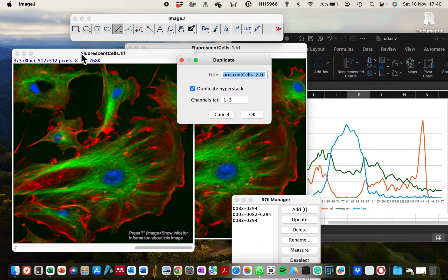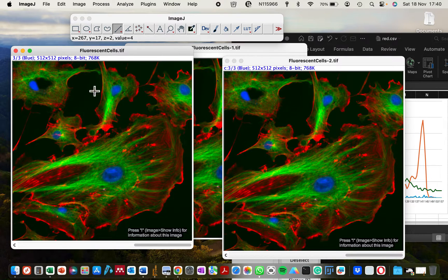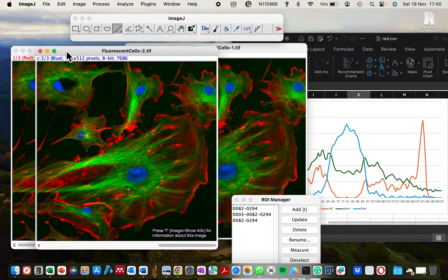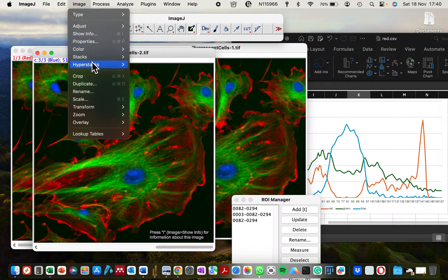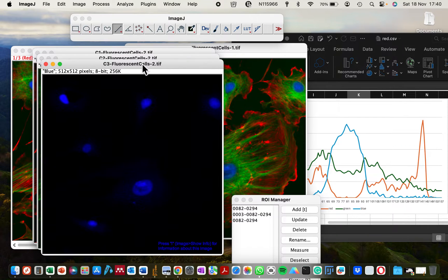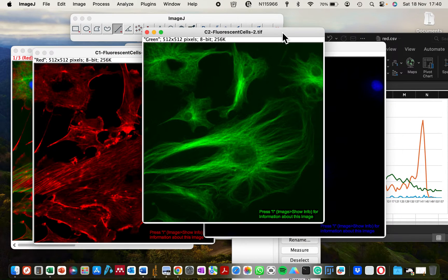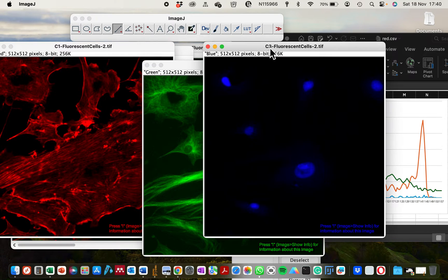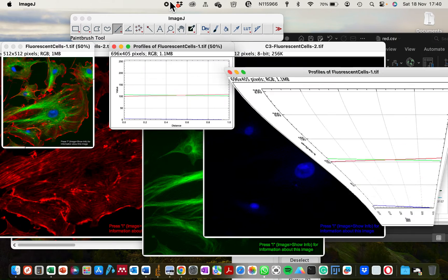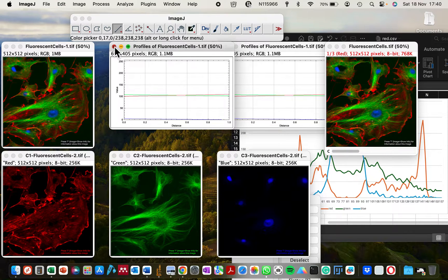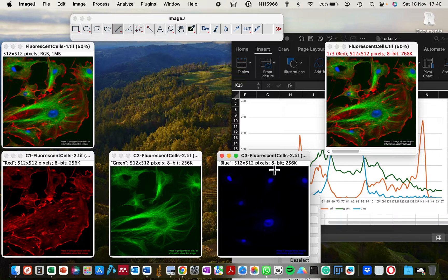For this tutorial you can decide to either work with the composite image as it is, or work with the individual channels for generating the profile plots. To get individual channels, go to Image > Color and select 'Split Channels.' Now that we've split the channels, you can see we have three individual single-channel images.